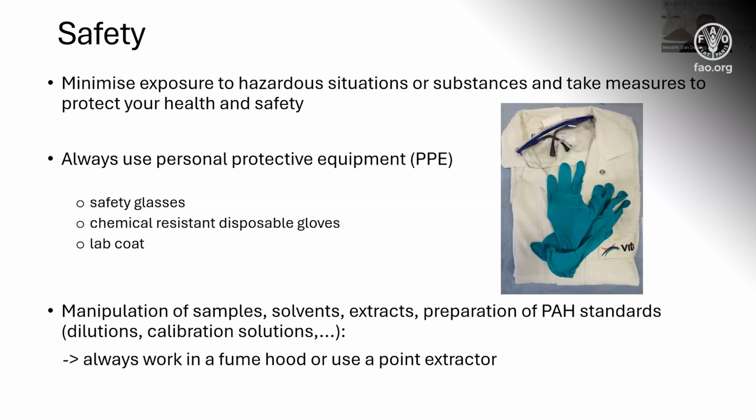Manipulation of samples such as solvents and extracts, or preparation of the standards, dilutions, calibration solutions, always work in a fume hood, or use a point extractor, because these solvents, like toluene and hexane, are also not so good for your health. So always work in a fume hood.